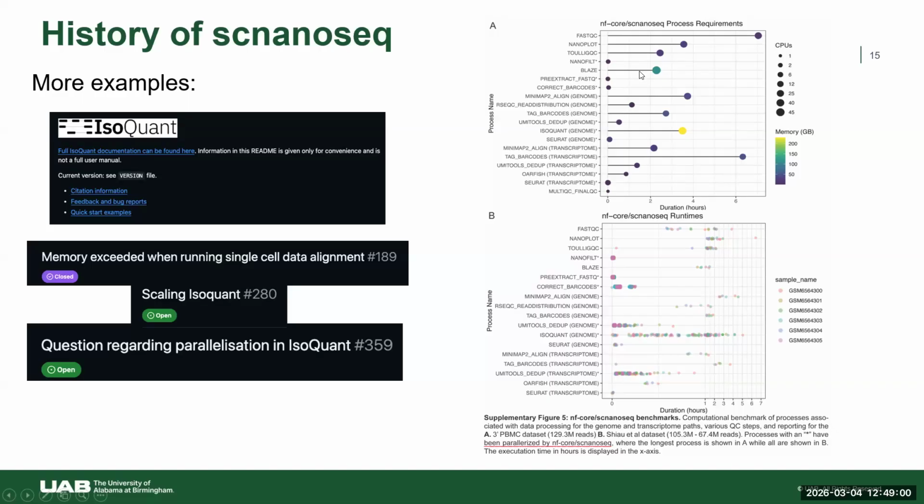We provide Nanoplot, we provide FastQC, which run in about 2 hours. It's not the fastest thing. It would be great if everything ran in 5 minutes, but I'm not worried about 2 hours. So if you don't want to run FastQC, disable it. You don't need to. The pipeline provides that flexibility.